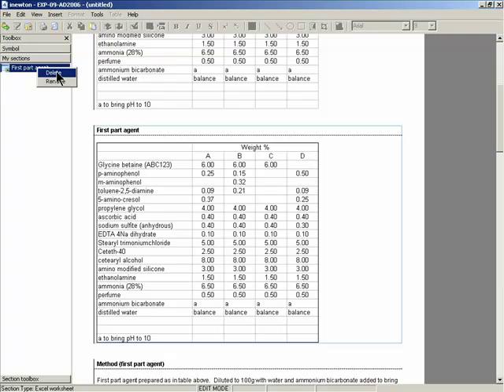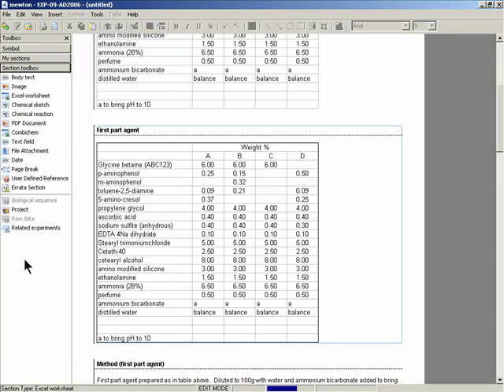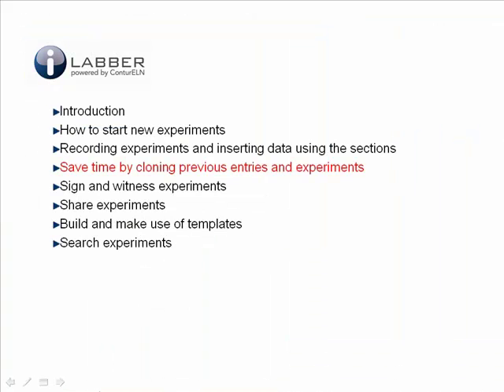And this works with all the section types. You can right click and delete or rename as you need if you no longer need them or if you want to change the name. And click back at the bottom of the section toolbox to get back the standard empty sections.